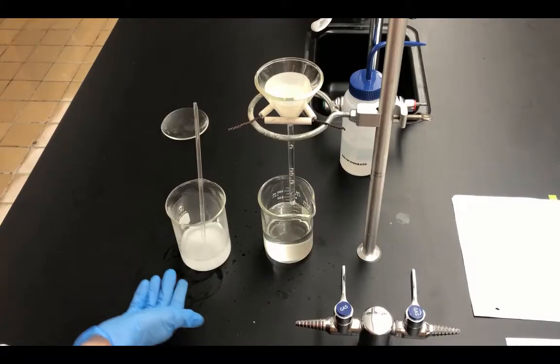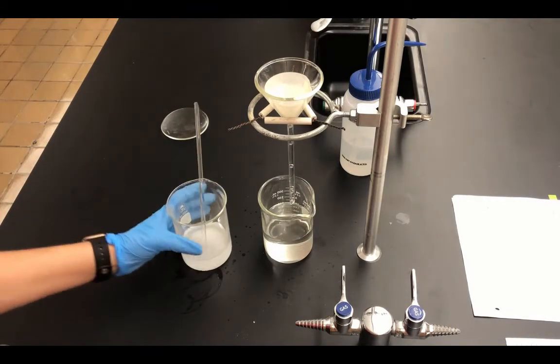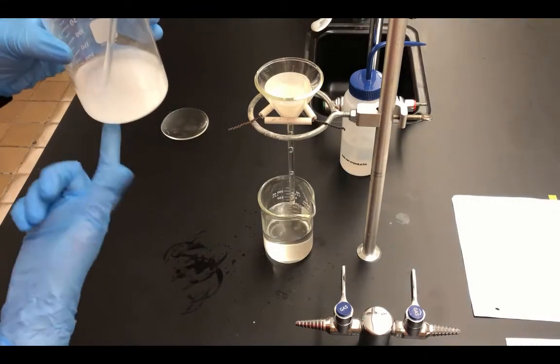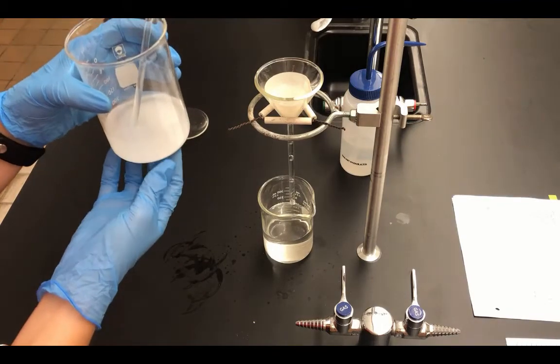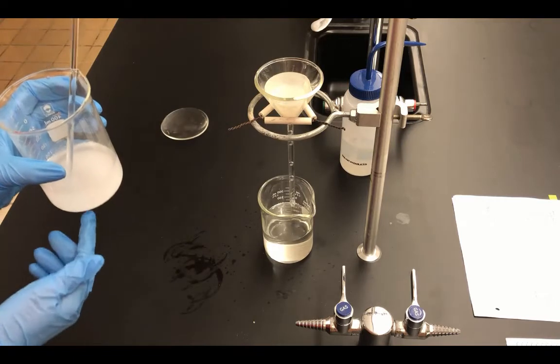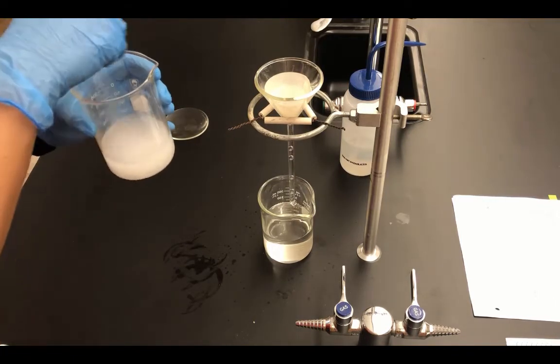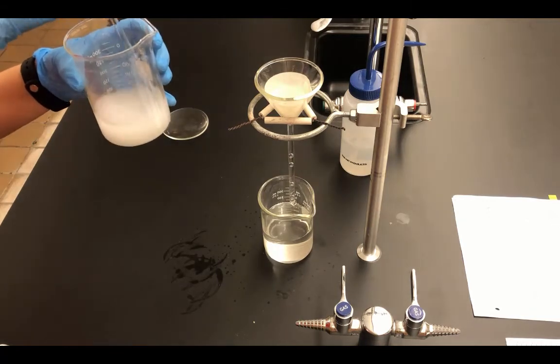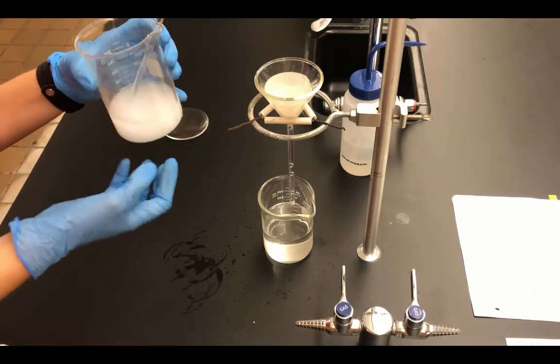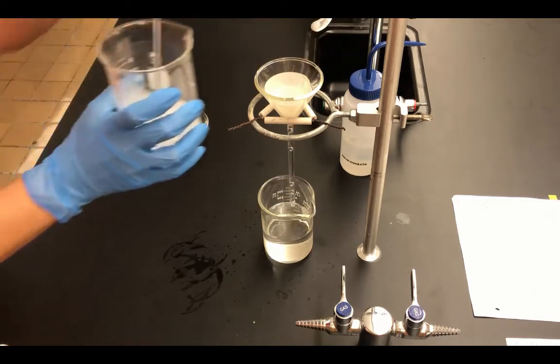As you get down to the bottom of the beaker, you'll notice that there's more and more solid starting to settle out of the solution. And so as you're filtering and getting closer and closer to the bottom, it's good practice to mix the solution so that you're suspending the precipitate in the solution, so that it's floating around.